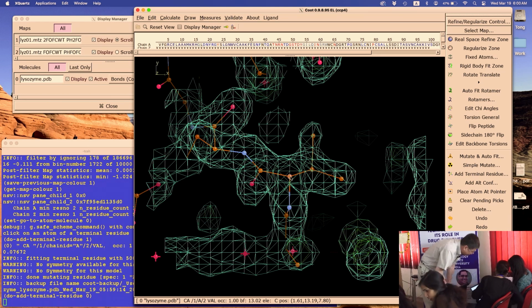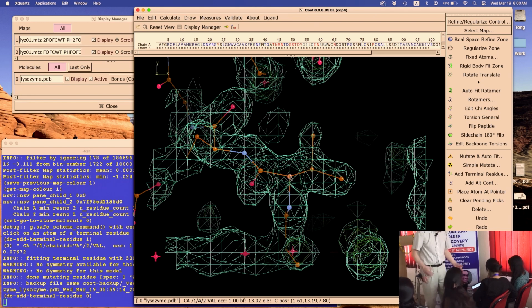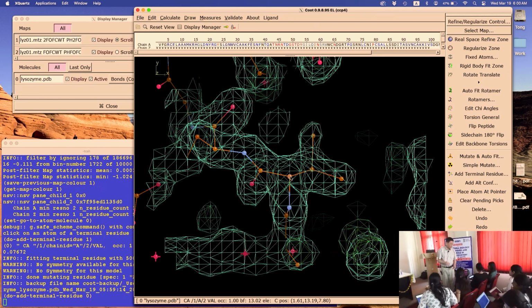It is built in. You just zoom in too much. Zoom out a little bit. No, that changes the right button. The other way. There you go. You have it. You zoom in too much so that everything got clipped out.